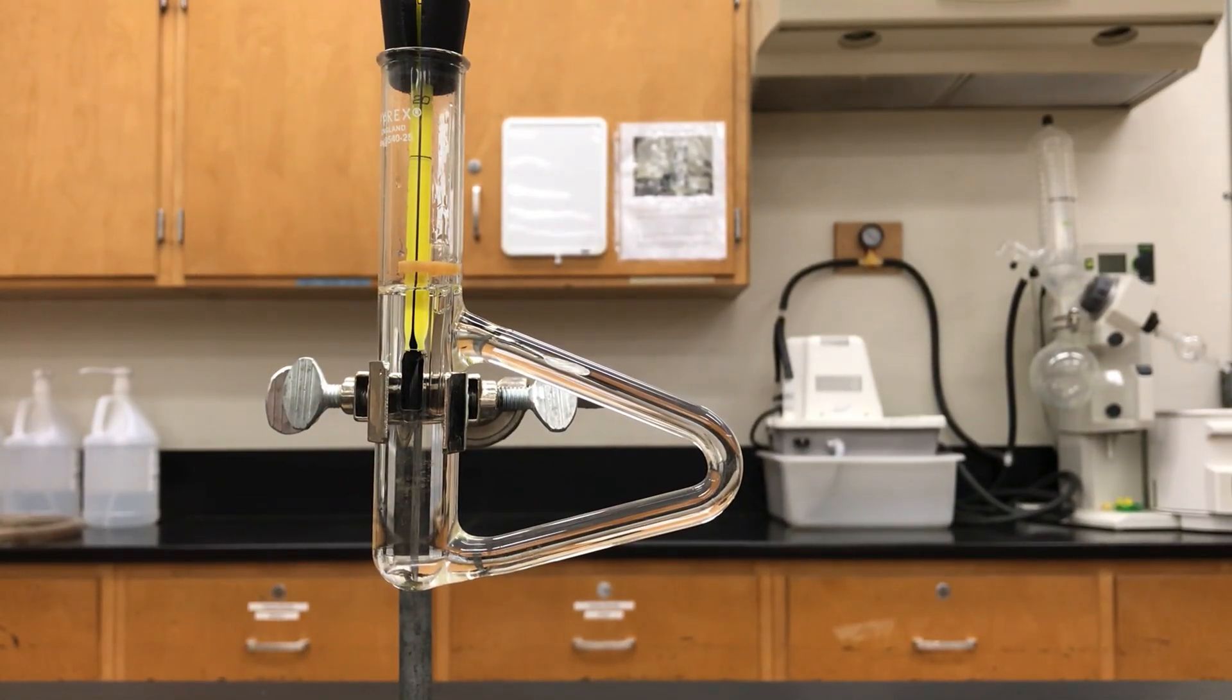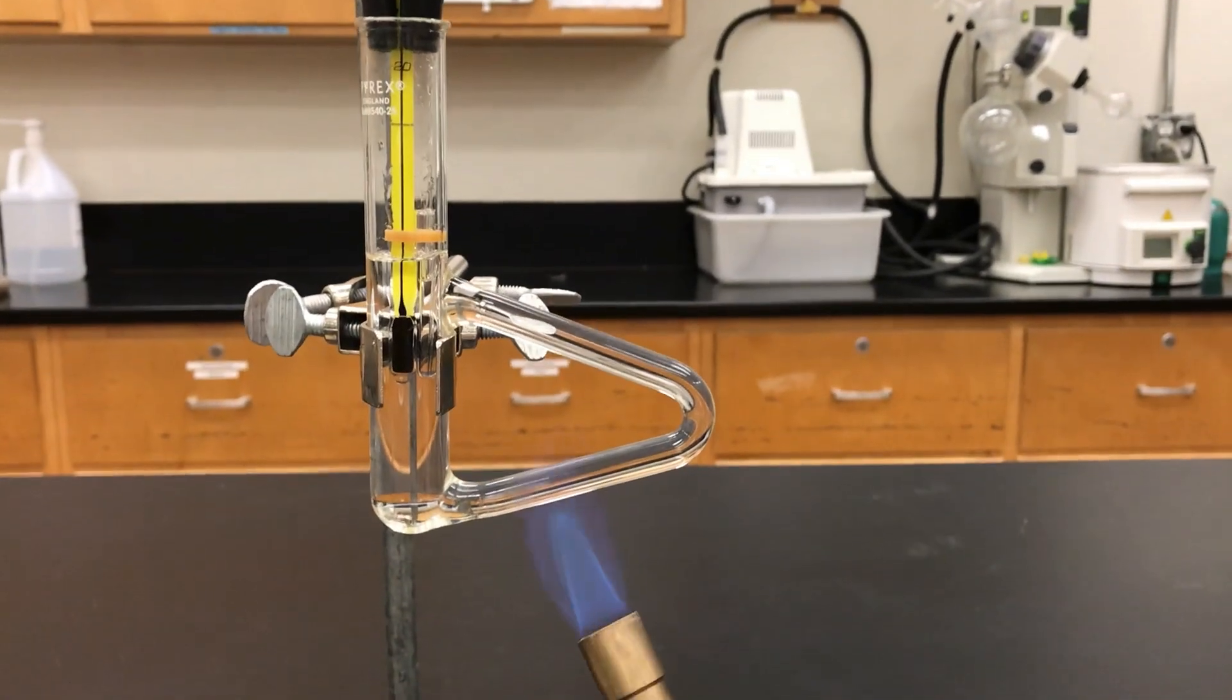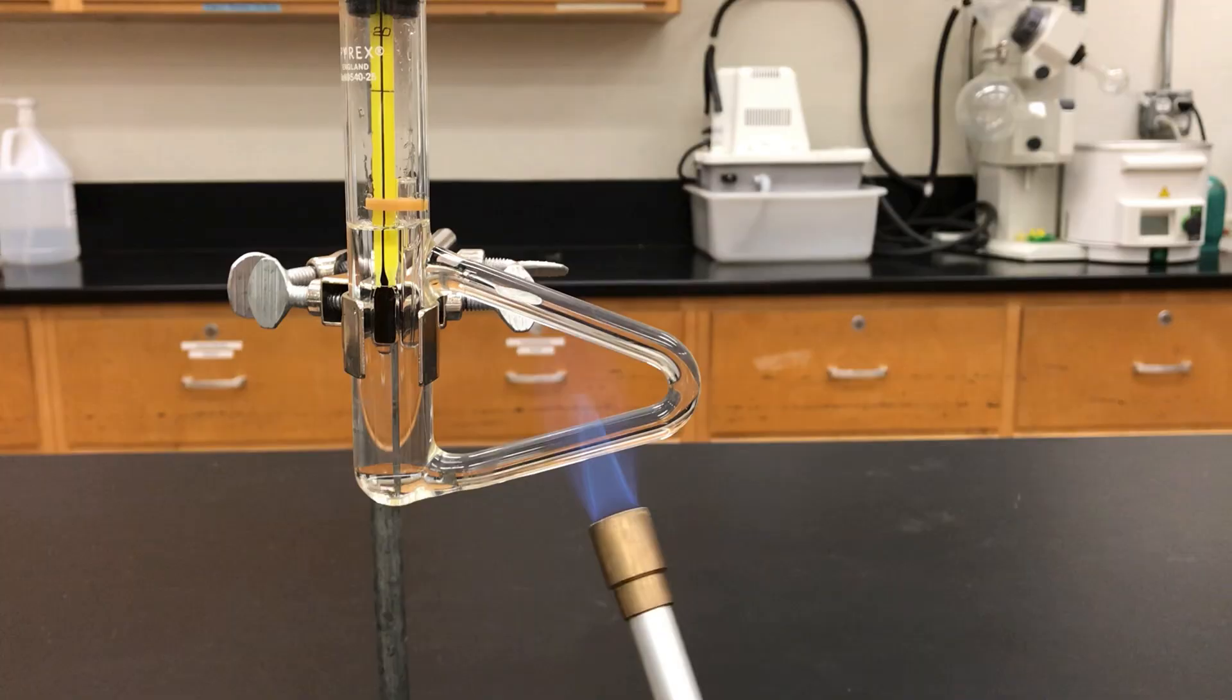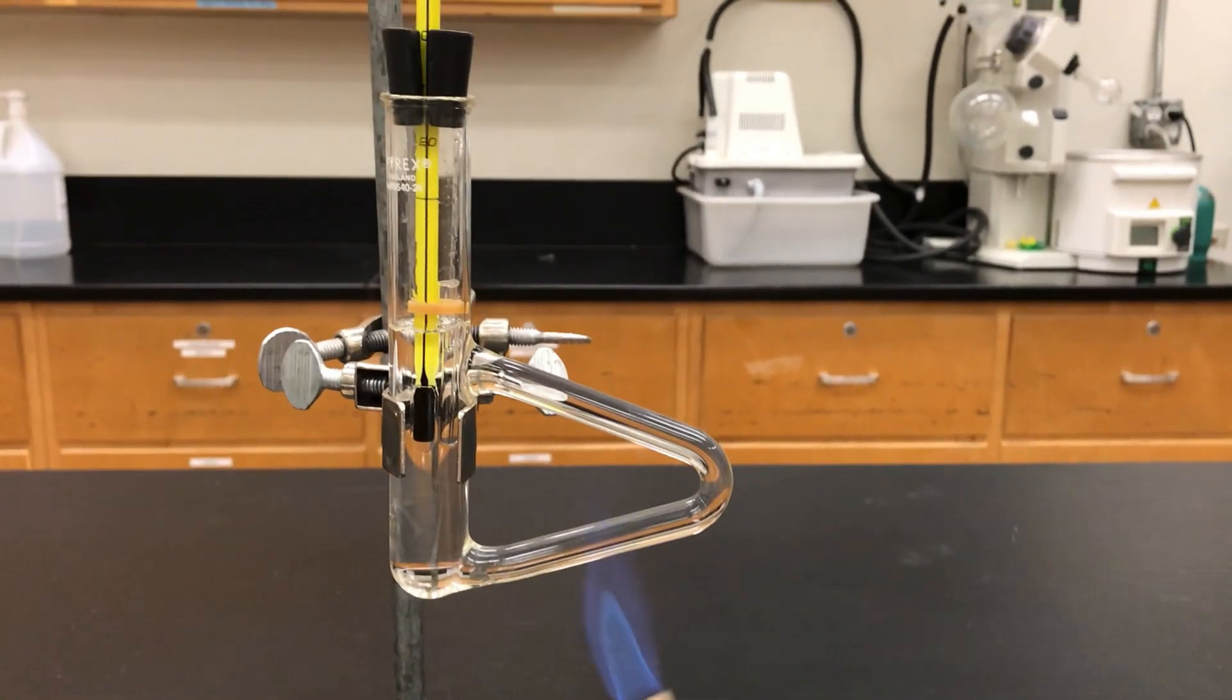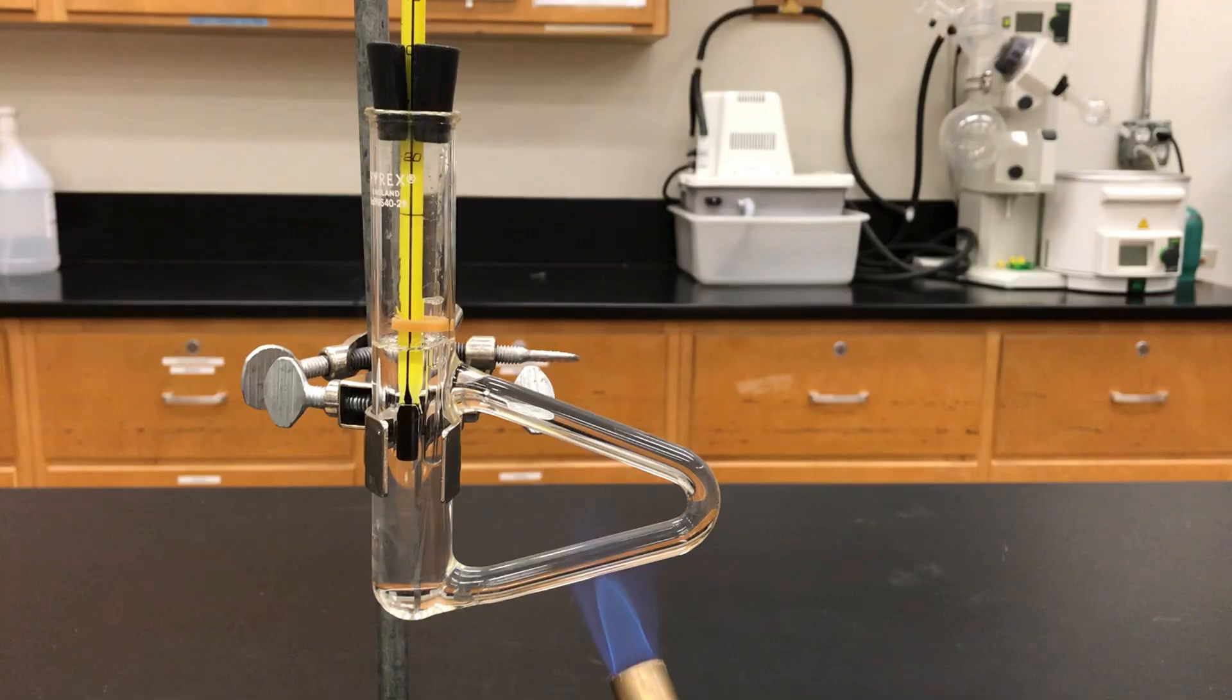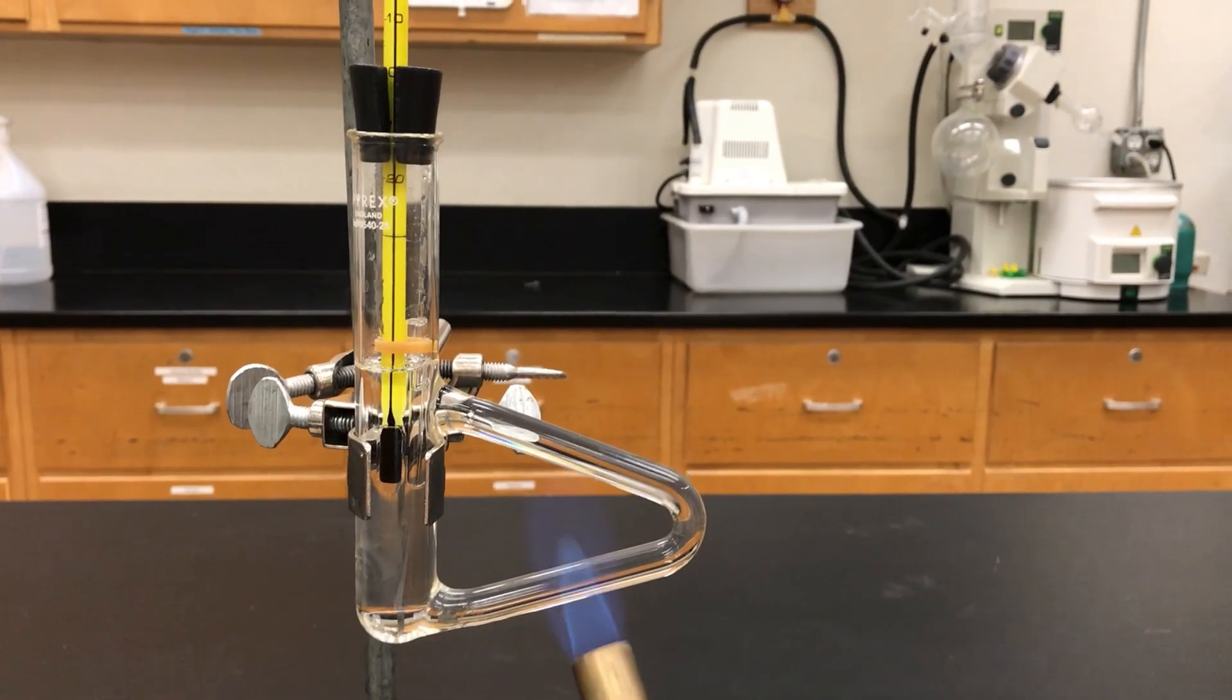Off to the side you then want to light a Bunsen burner. Bring that in and start heating the arm of the Thiele tube. This is a way to indirectly heat the sample because you'll end up creating a current within the oil. The hot oil will rise, the cooler oil will sink, and you'll create a current that eventually moves energy around and heats your sample.